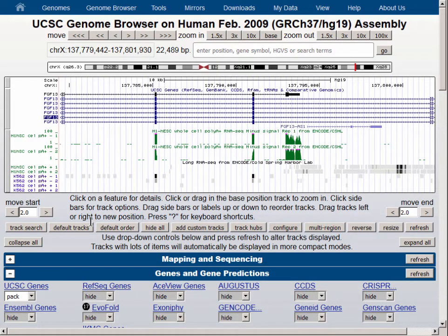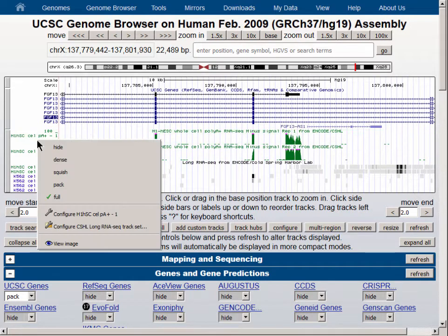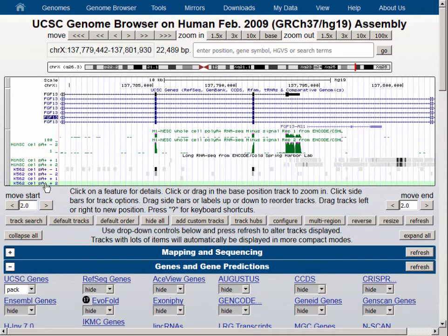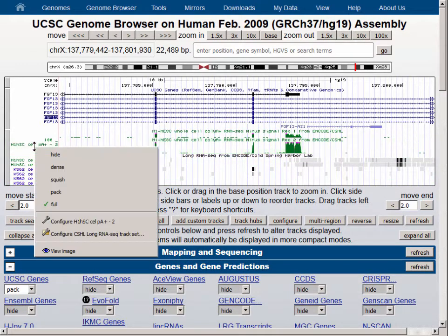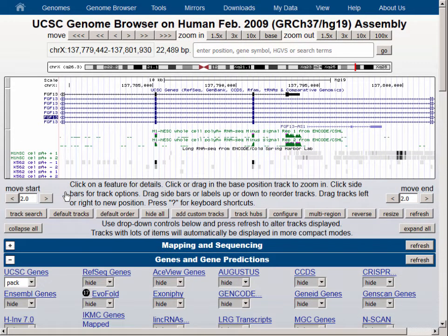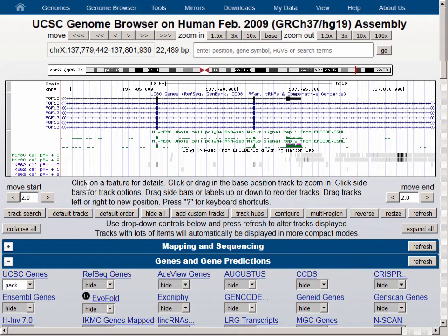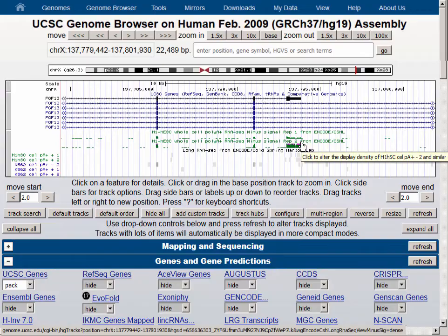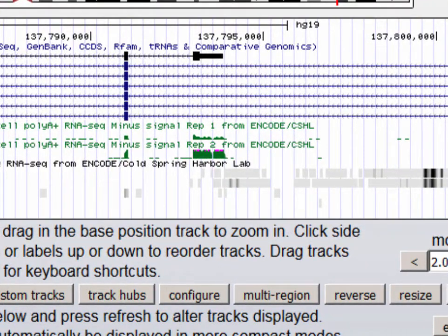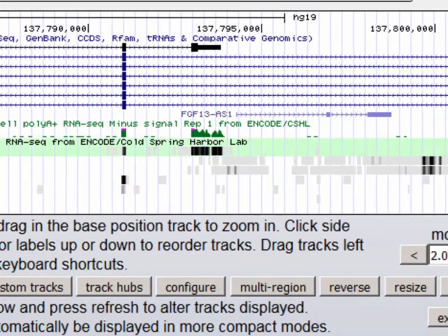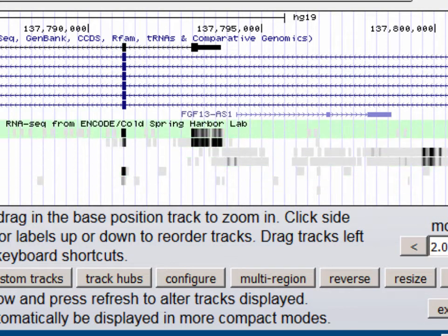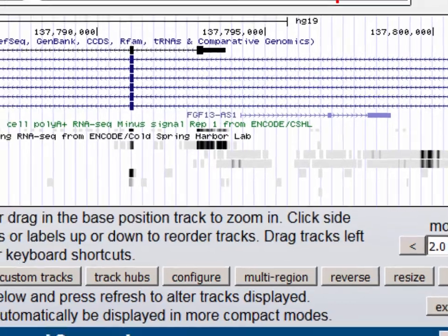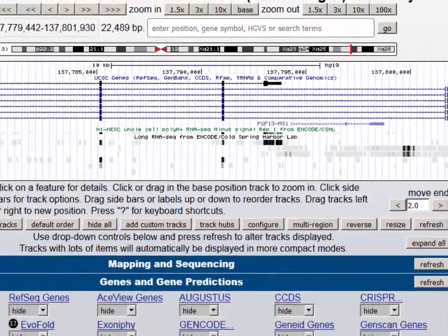Let's take a look at what Pack mode looks like for these wiggle tracks. You can see that it's essentially the same as full mode except that it takes up slightly less screen in the vertical dimension. Notice that in both Pack and Full, the little pink hats on the peaks indicate that there is data beyond the maximum vertical setting. Switching these back to dense and trying Squish mode, you can see that it's essentially the same as dense but takes up even less vertical real estate.